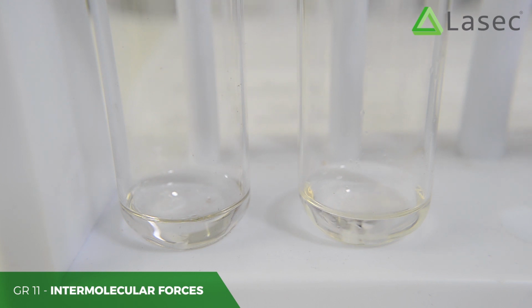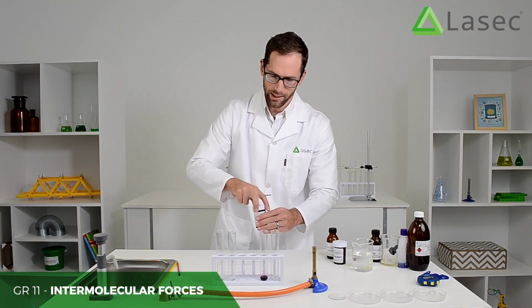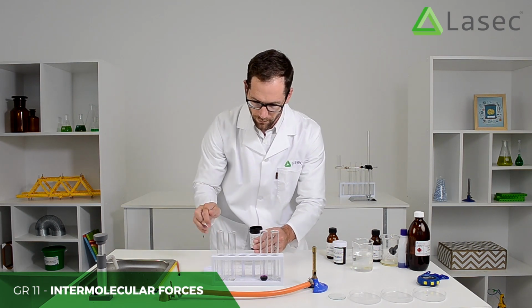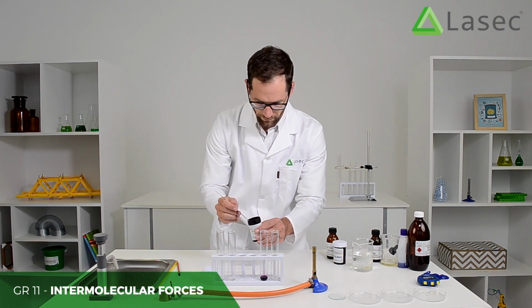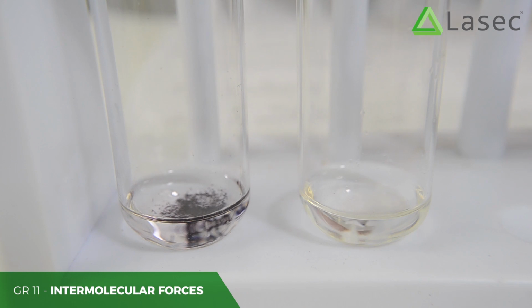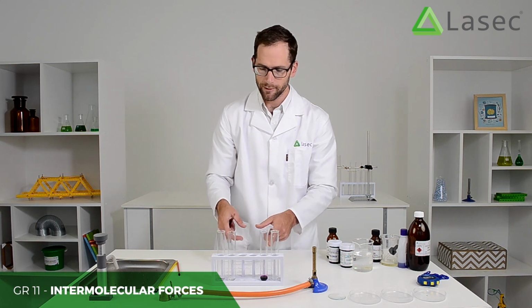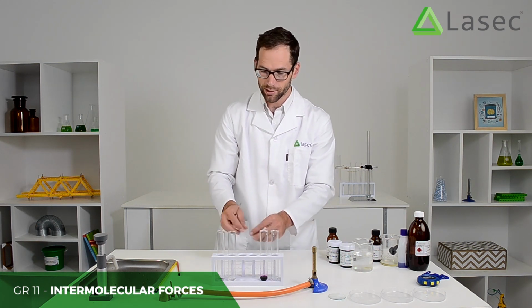So now the learners, they put it in, they take a look. I can immediately notice something different with the sodium chloride and ethanol. And now we're going to take the potassium permanganate. They'll time this as well. There we go. I'm already noticing something quite different here. And what I'm observing here, just for your sake, is that in the ethanol the crystals are not dissolving. Maybe over time we'll give them a bit of time to dissolve, but initially as I throw them in, the ethanol is still clear and I can see the crystals well defined.